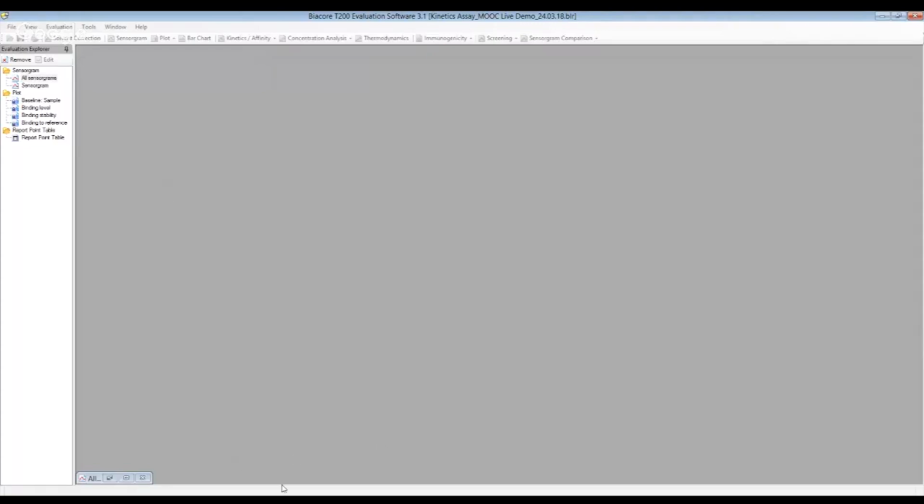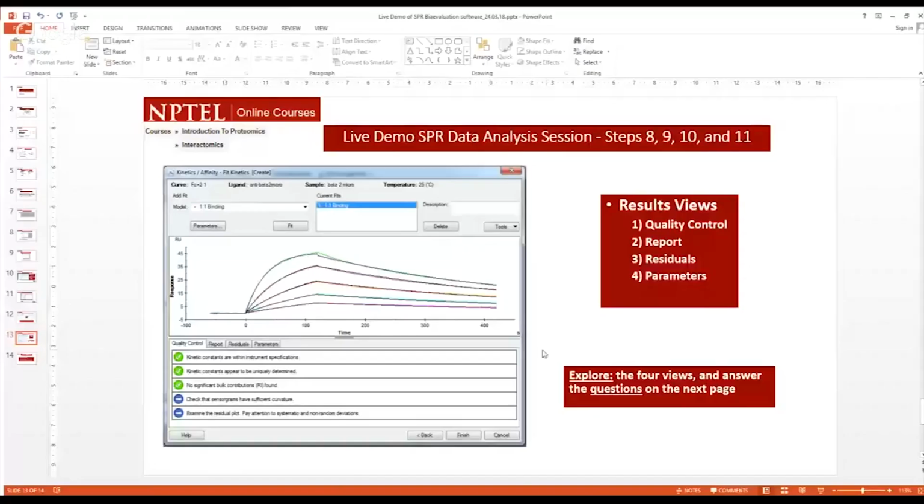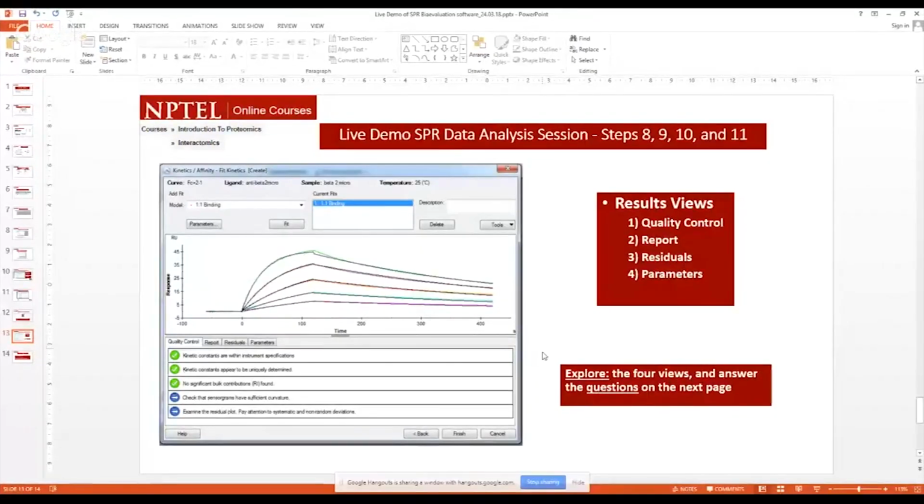All right, I think we are not able to display the overlaid slide in real time, but it is actually the same as in the PPT. So it's actually quite self-explanatory, the PowerPoint. Right.